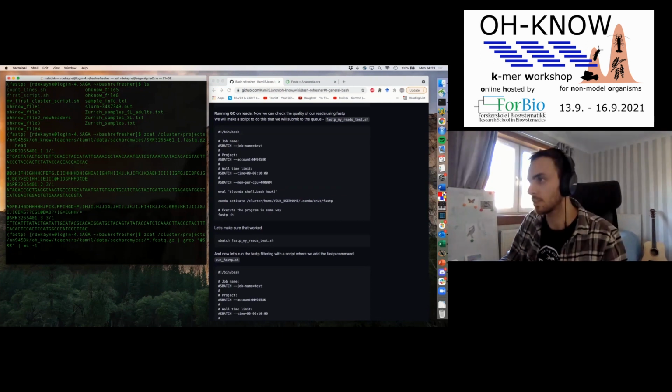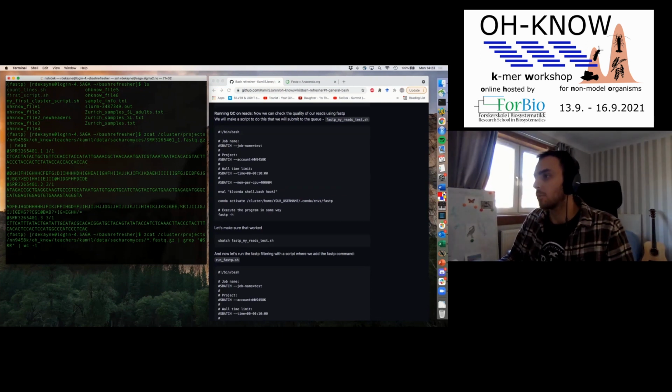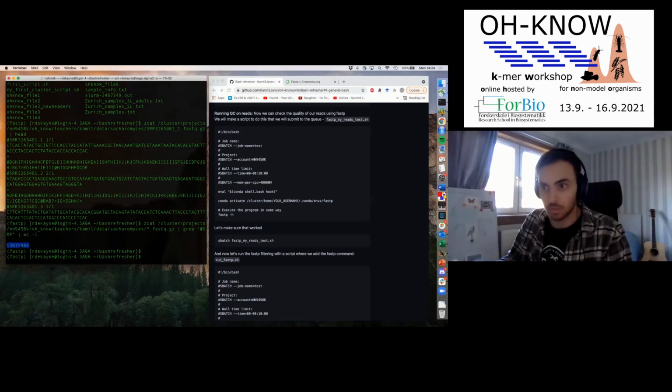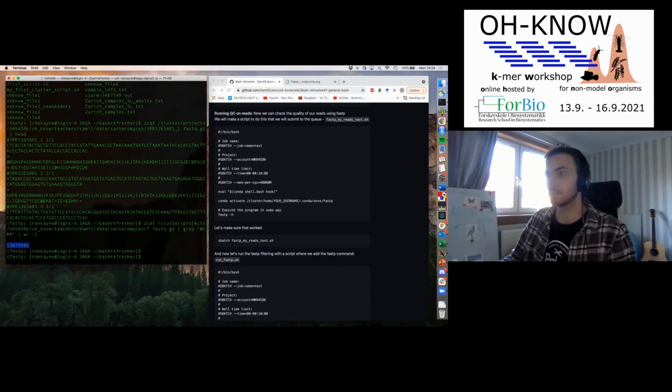We'll just give it a second. And what we're going to do now is go through how to run this fastp script. Oh yeah, so you see here, this is the number of sequences. So what is this? 13 million sequences.